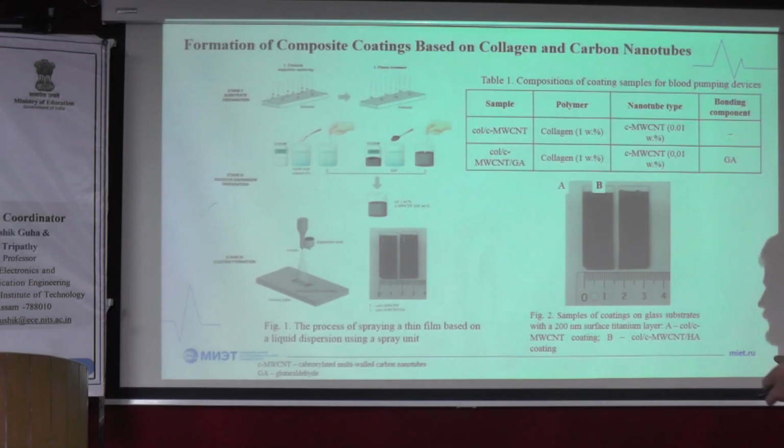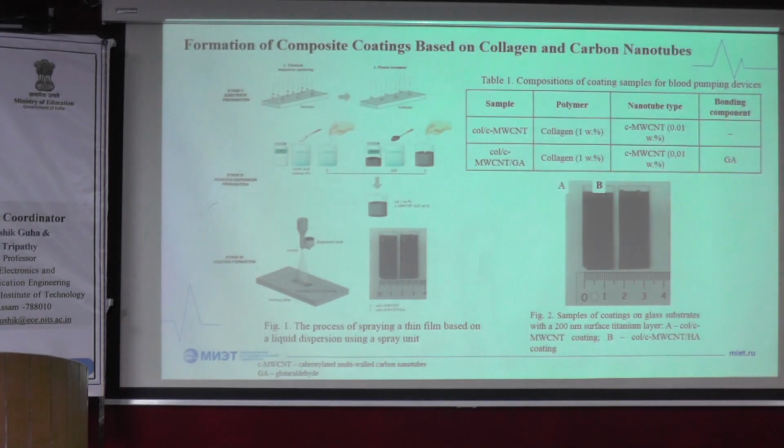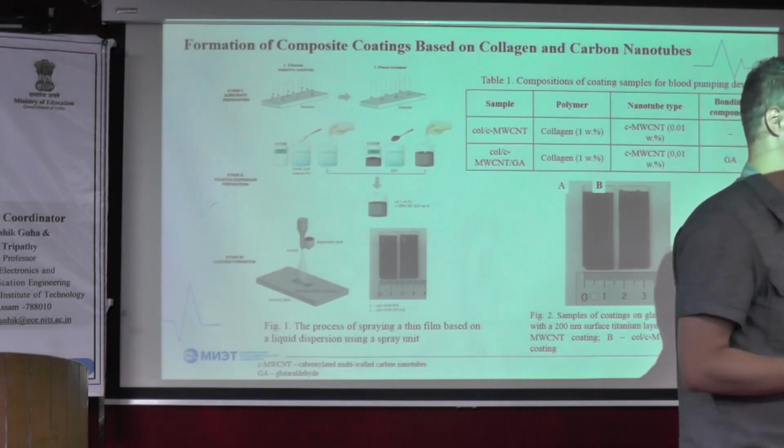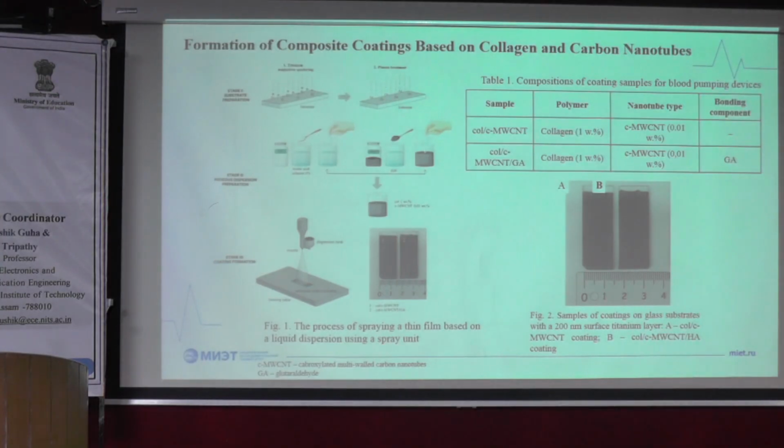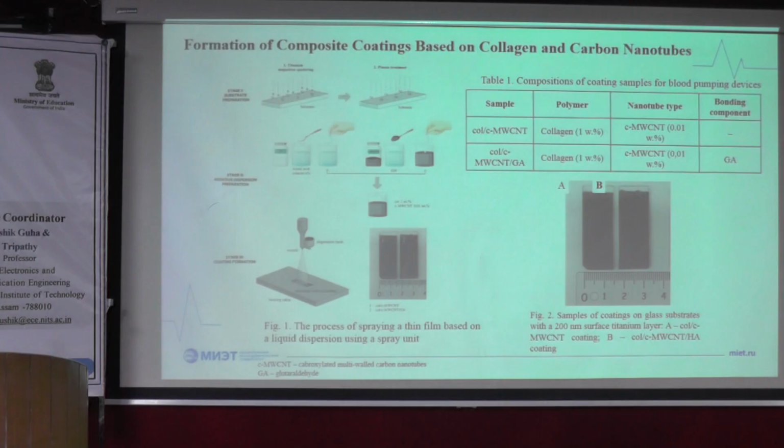So despite the fact that it has very amazing mechanical properties that are quite suitable for surfaces that we're going to use in this system, the safety issue is the primary concern here. So if we're talking about carbon nanotubes, the main candidate for the further experiment is the multi-wall carbon nanotube, which does not have the same interaction with biological tissues as the single-wall carbon nanotube.